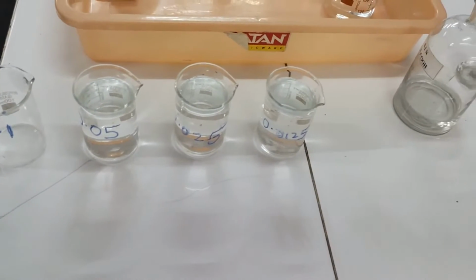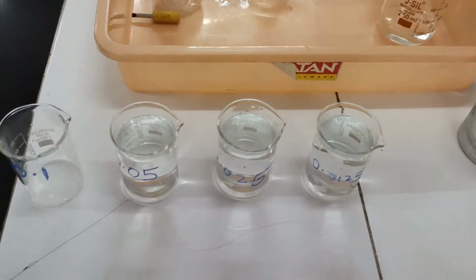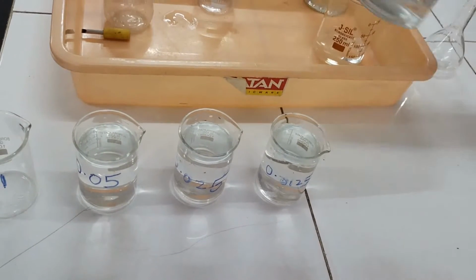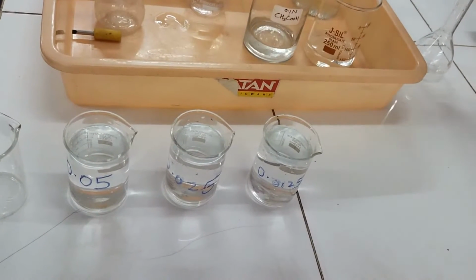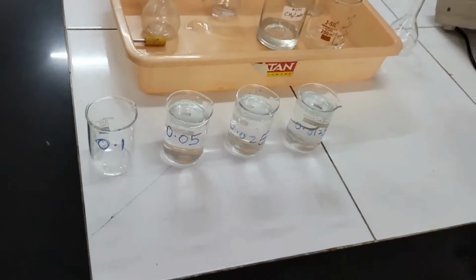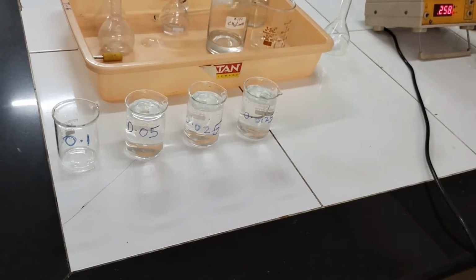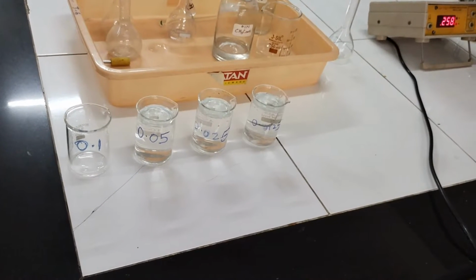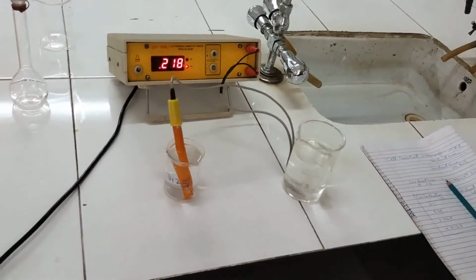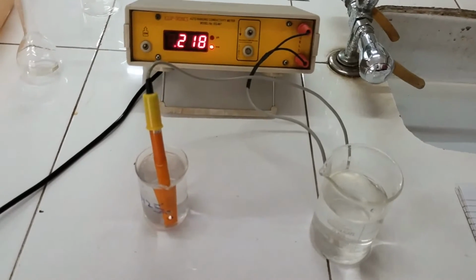Alright, so this is the most important step, my dear friends, about dilution of the solutions and preparing the various concentrations from the given 0.1 normal acetic acid. Now the next job is very easy. We need to just take the readings of the solutions by introducing the electrode as I have shown for 0.1 normal KCl. Yes, my dear friends, now the simplest job: we have prepared the solutions. We will now take the reading.